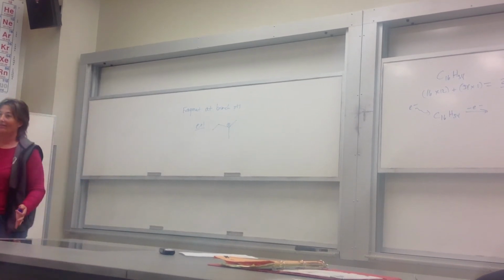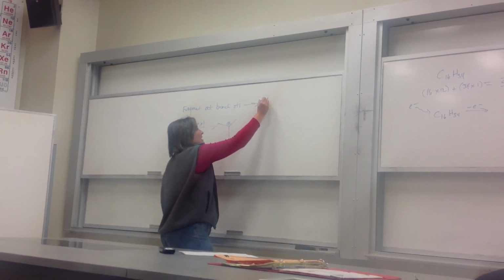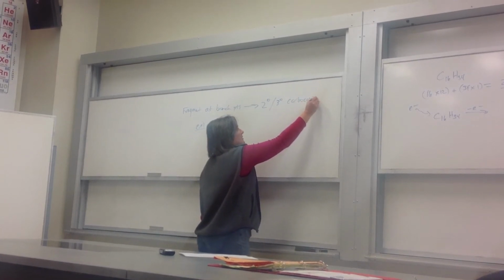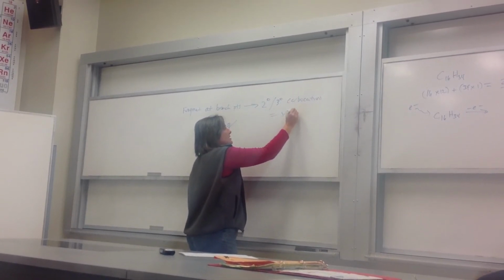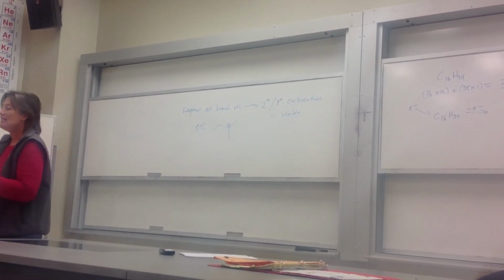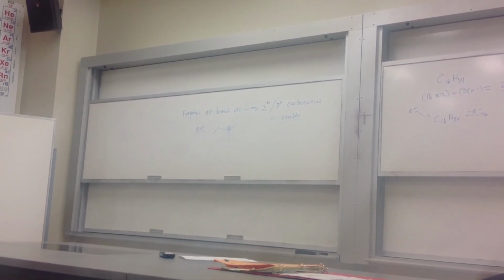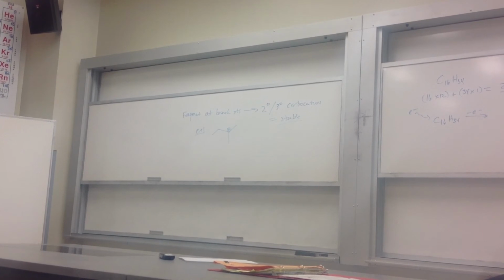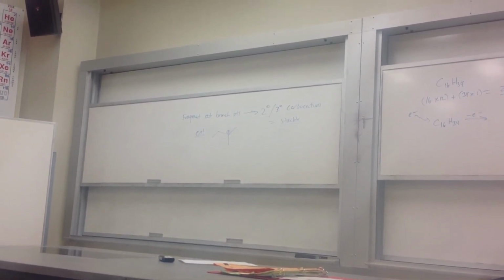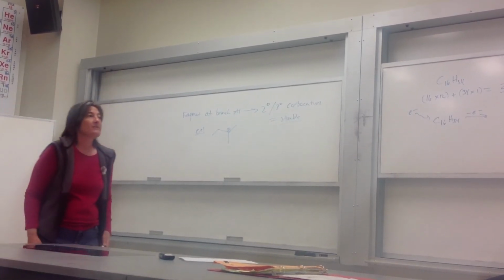What do you see there? Tertiary carbocation. So if fragments at branch points, that gives you secondary and tertiary carbocations. And those tend to be pretty stable. And so we're going to see big peaks for fragmenting at branch points. And those tend to occur pretty readily because they're more stable. And so your parent, when you initially form it, tends not to last. And so with these, you don't really panic if you don't see a parent. You might, and you might not, and that's okay.